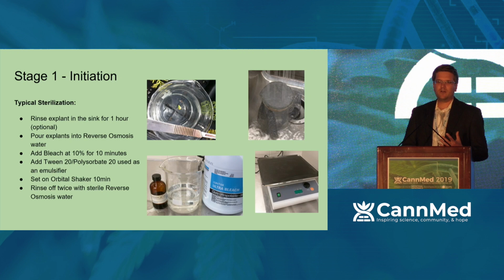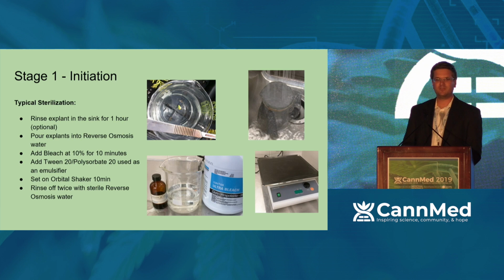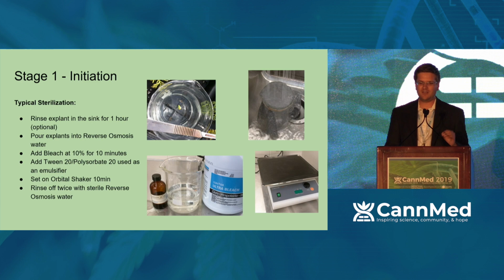So right now, I want to get into stage one, that initiation stage, because this is where the magic basically happens, why everybody wants to advertise tissue culture to you. And it's all about just cleaning the exterior tissue of your plant. I'm not talking about endophyte removing or anything else. All I'm talking about is taking something like Tween 20, which is a non-ionic detergent, and adding it with some bleach to some reverse osmosis water, so there's no minerals in there, mixing it up for about 10 minutes, and then transferring everything under your laminar flow hood in order to maintain a sterile environment. That's about it, but the key there is maintaining clean tissue from the start.